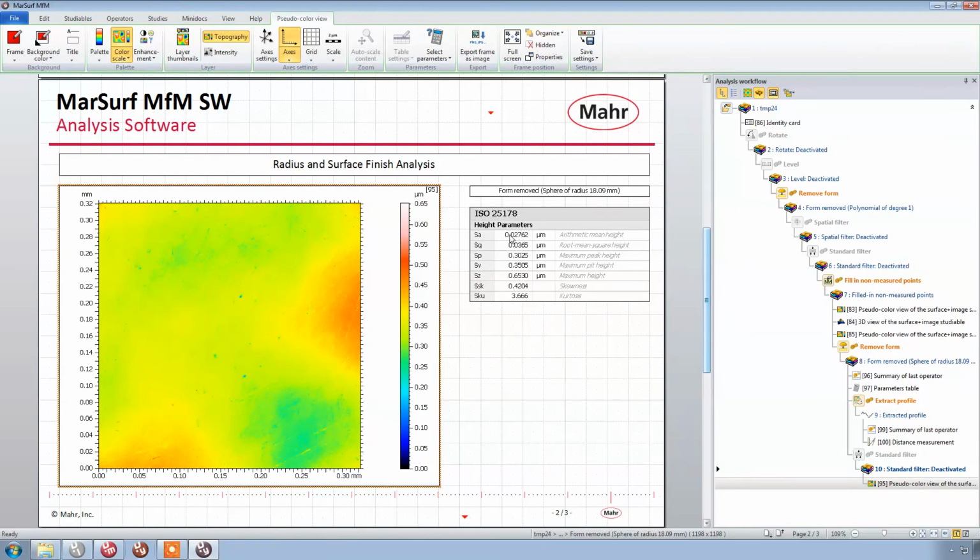And if we look at the roughness, I was really expecting single-digit roughness here, and we are seeing 27 nanometers. Still very low roughness. I was expecting 10, 7, 8 nanometer roughness. What that says to me is that we are still picking up some of what I would consider the waviness component on this surface. We're not really seeing the surface finish.